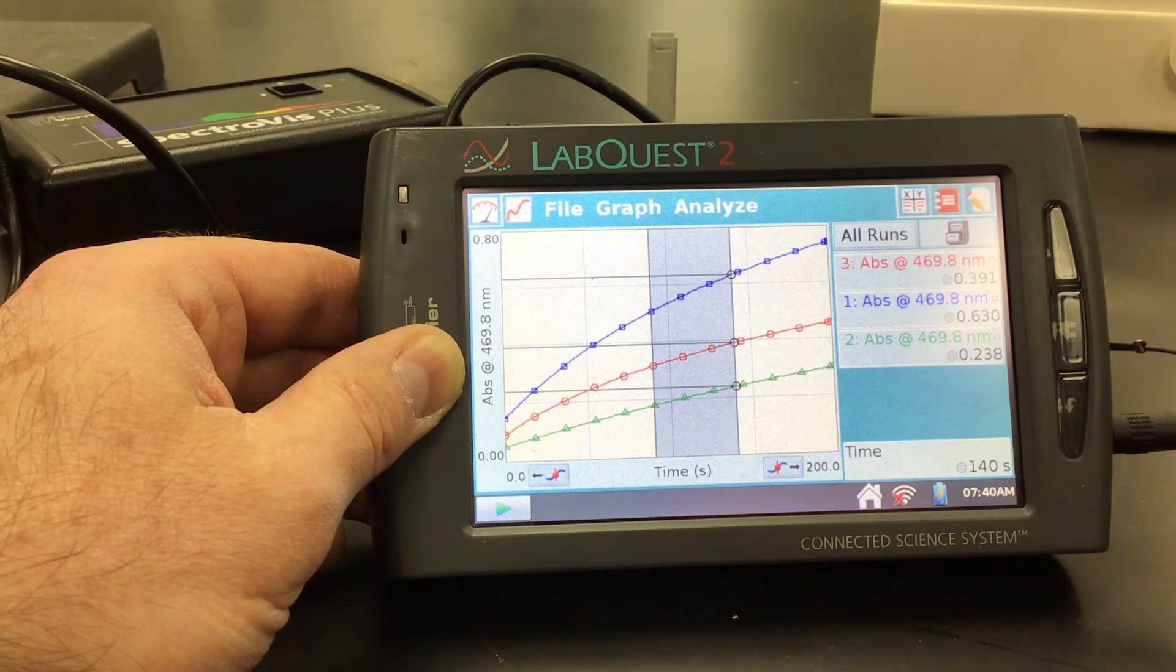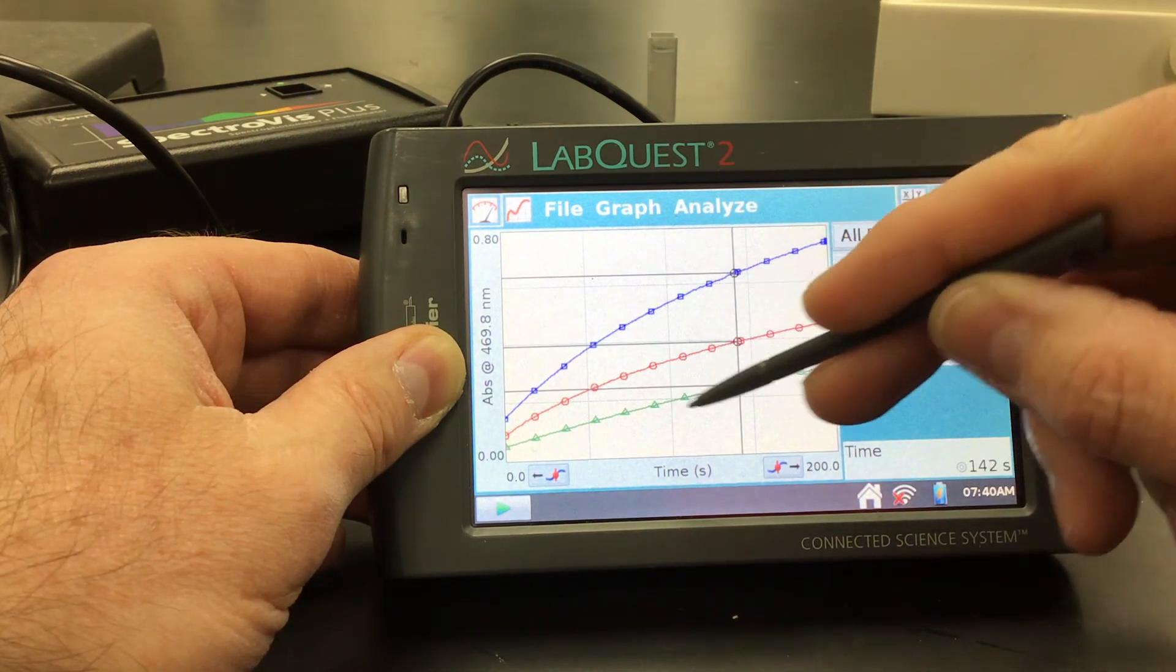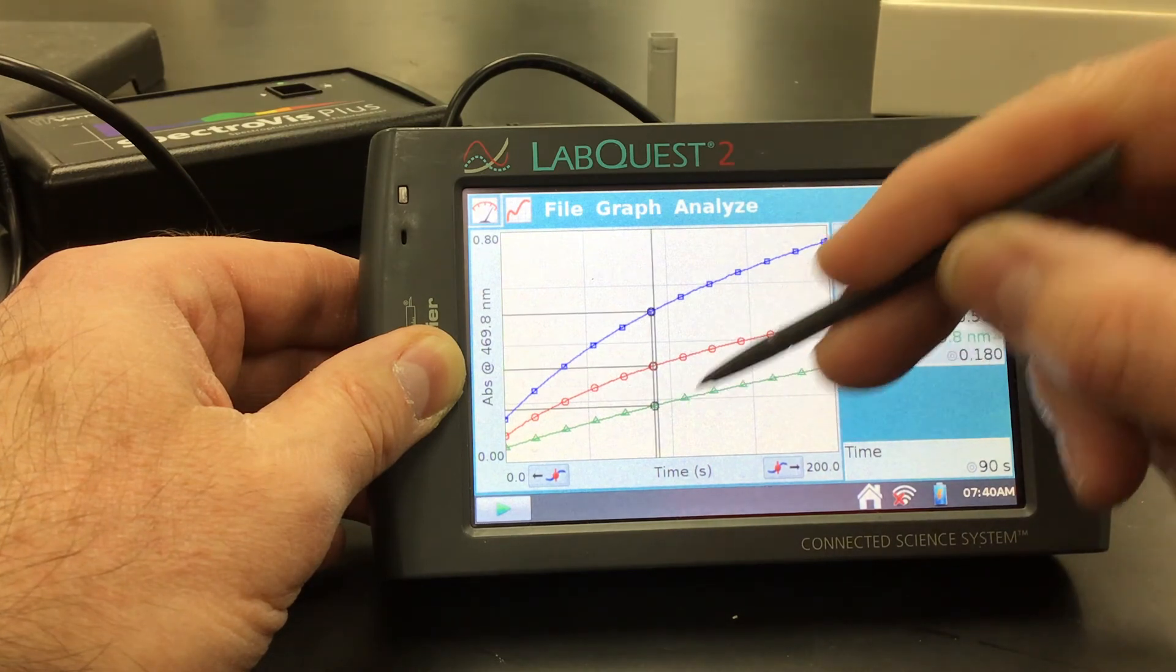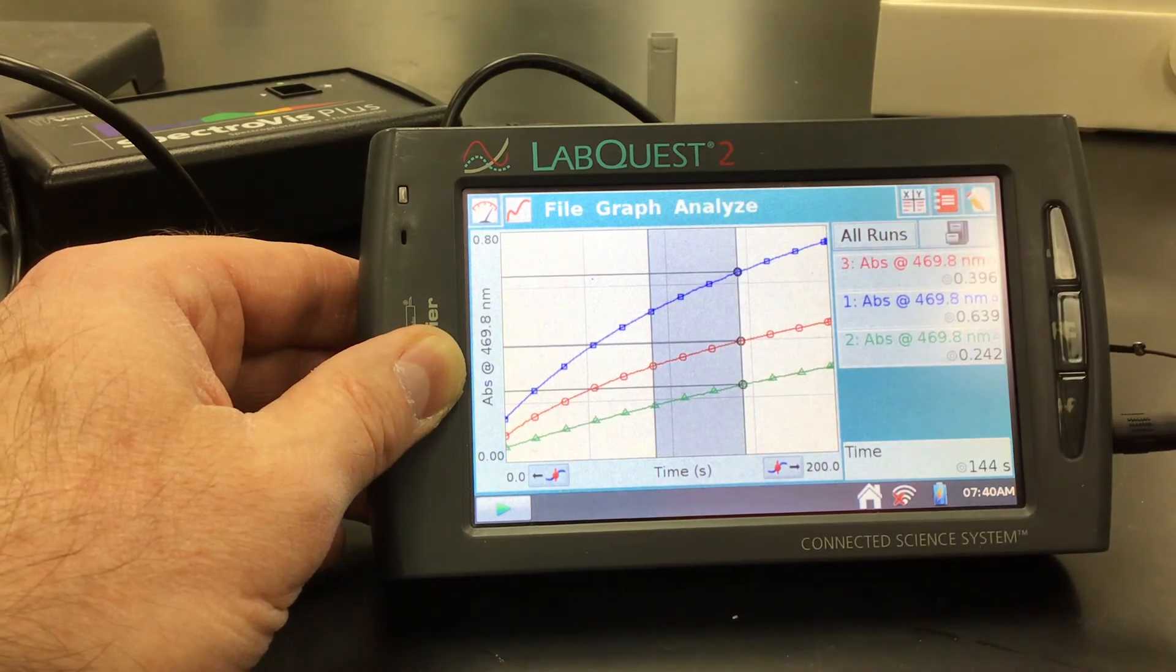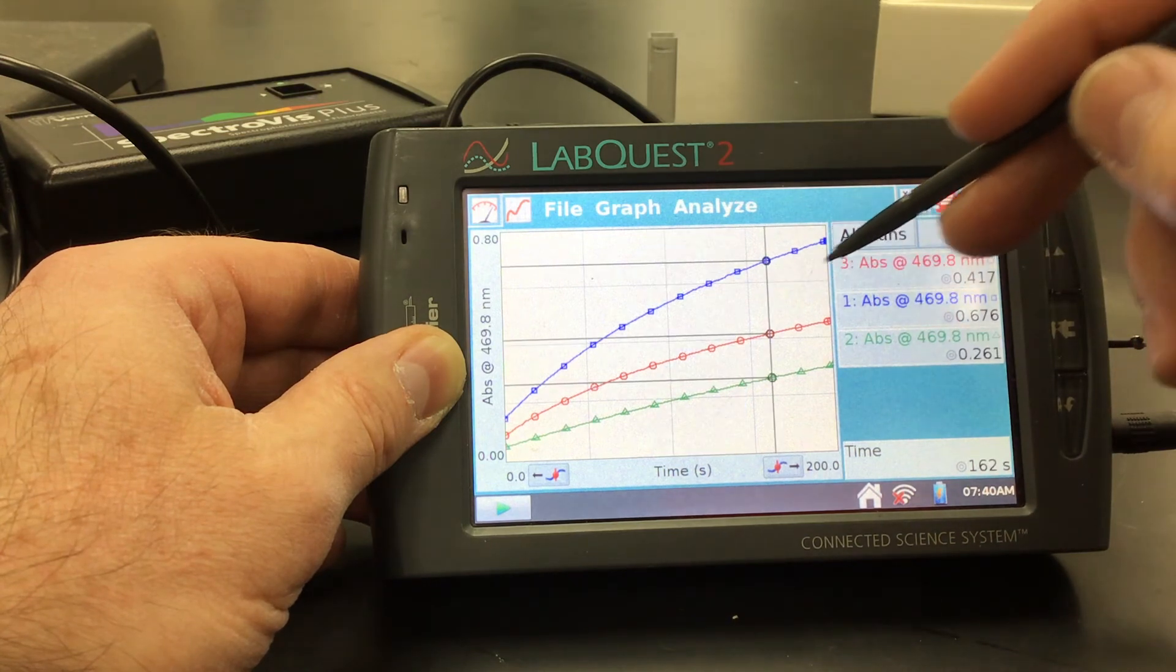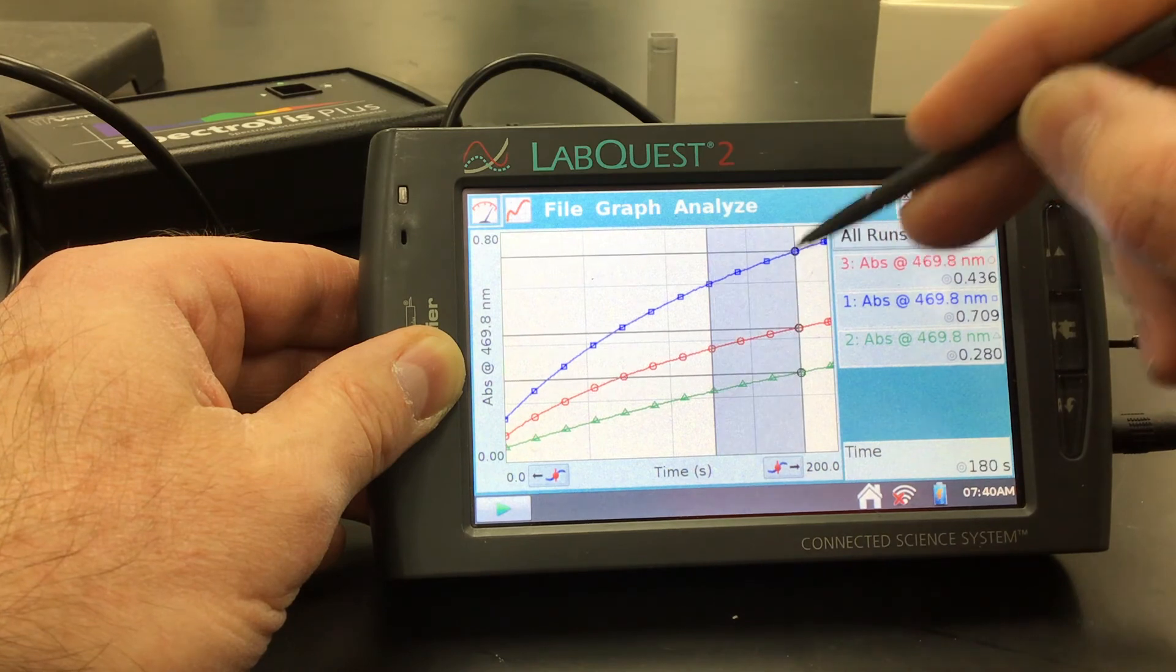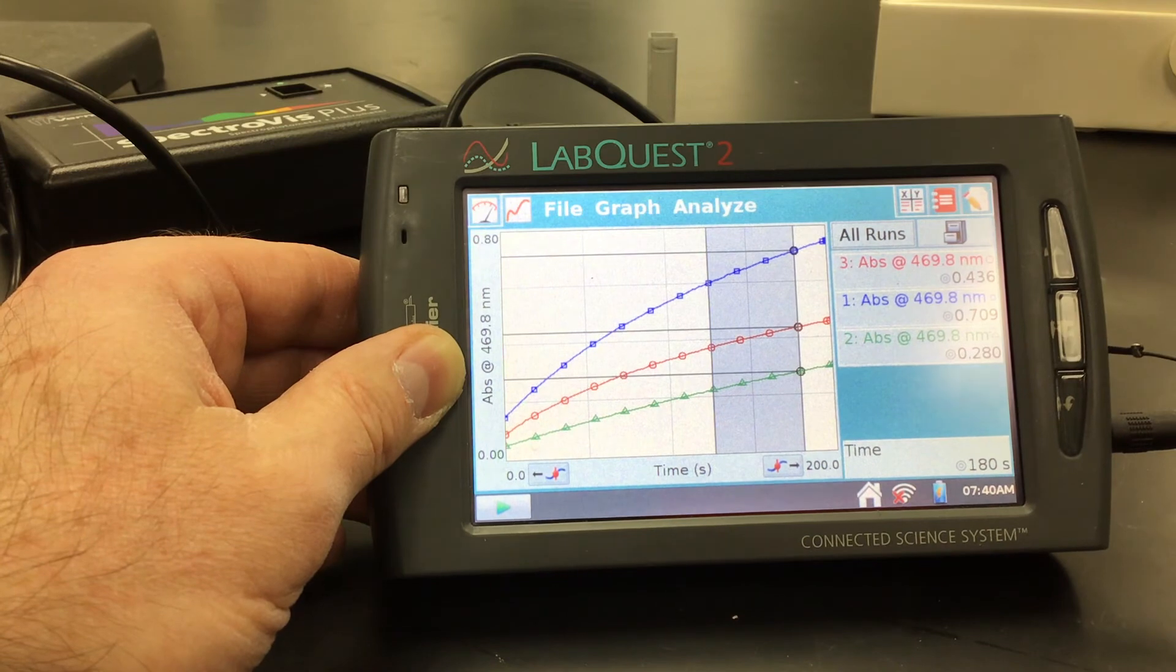So that's at 140, and then if I was here, it's at 90. So 30 to 40 seconds would be maybe like from here to here. That could be a portion that was linear. If you felt a different portion was linear, we could select that as well. Maybe I'm going to say from here to here looks pretty linear for all runs.